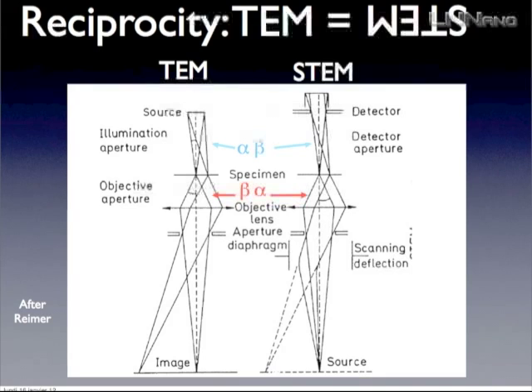So if you follow the path, you see how it looks the same, depending on the position of the source. You enter the objective lens, and you will focus on different parts of the specimen. Just like on different parts of the specimen, there was a ray path in different directions. And then the probe is hitting the specimen. And now the detector is an integrated detector. There is no resolution in the detector. It's a BF. Like the source was just a point or a smaller area. So there is a direct analogy between both of them.